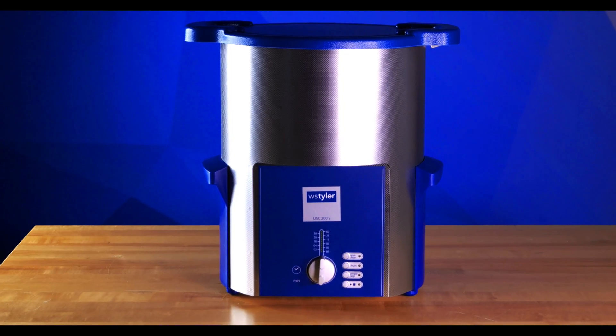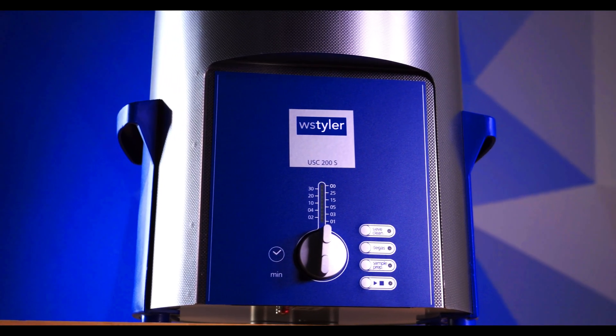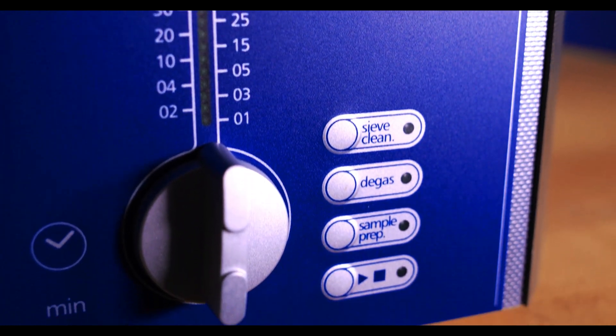Sometimes, with finer mesh test sieves, the small openings prevent particles from being dislodged. If this is the case, an ultrasonic cleaner will most likely get the job done. This machine uses a very distinct vibrating motion as the mesh is submerged in a cleaning solution. The vibrations shake the particles loose without damaging even the finest of mesh.